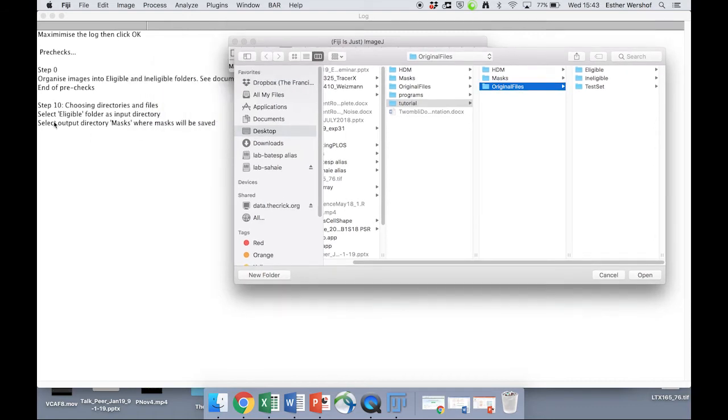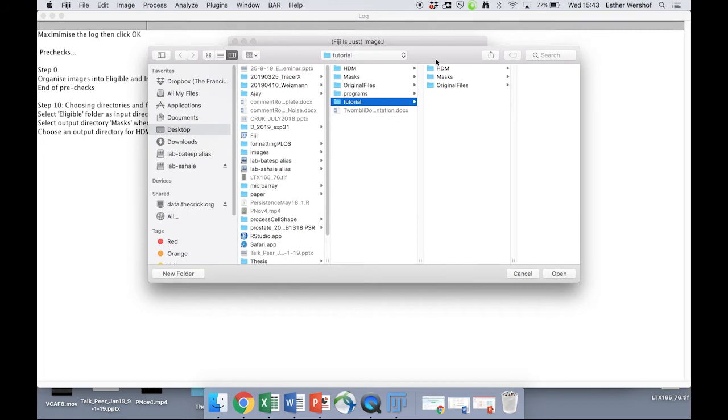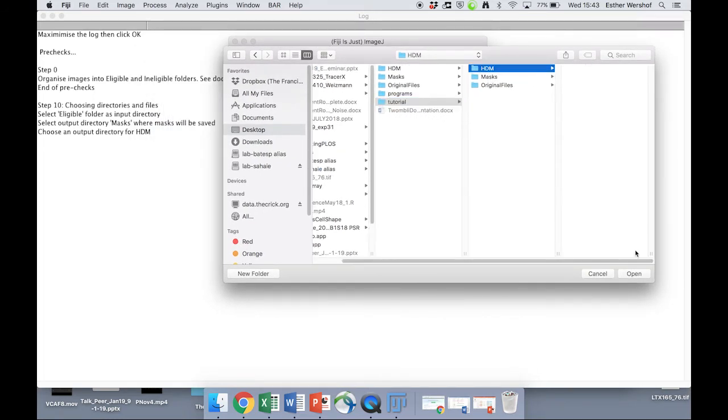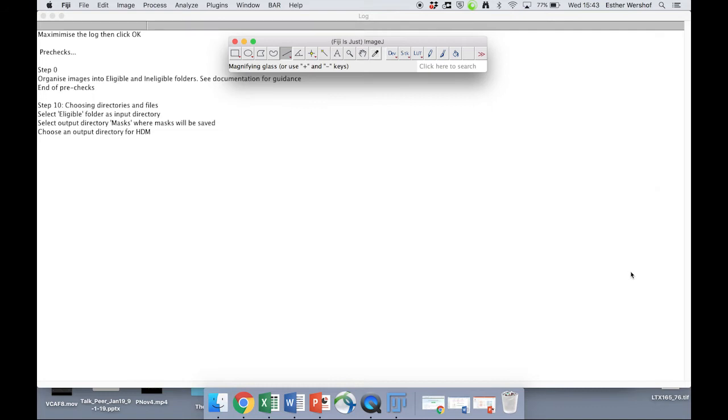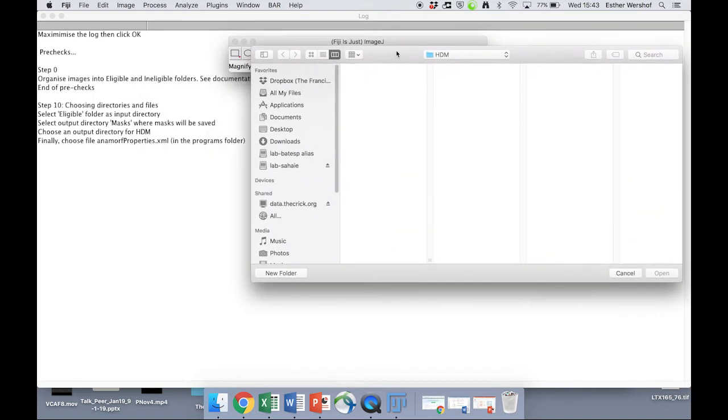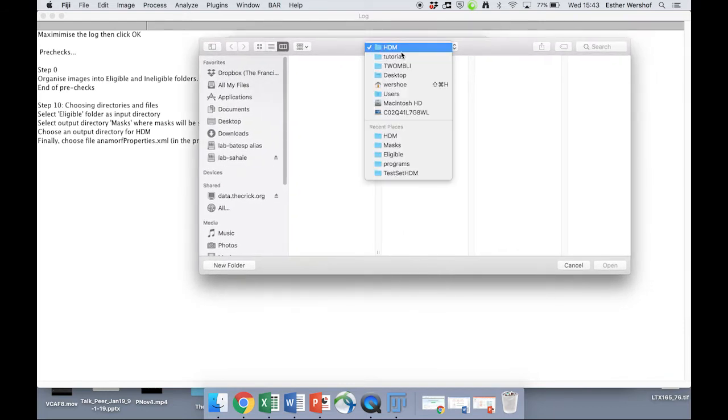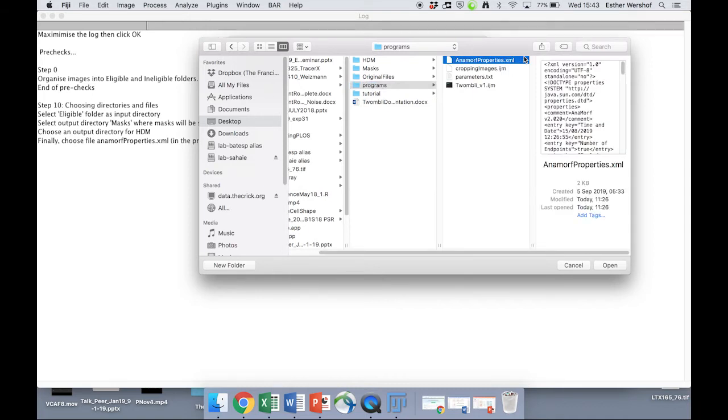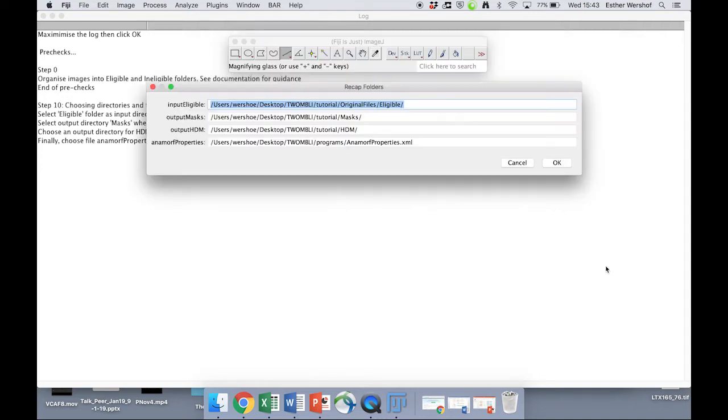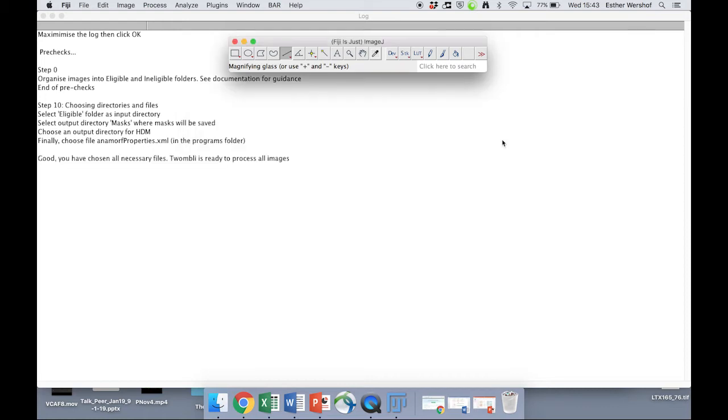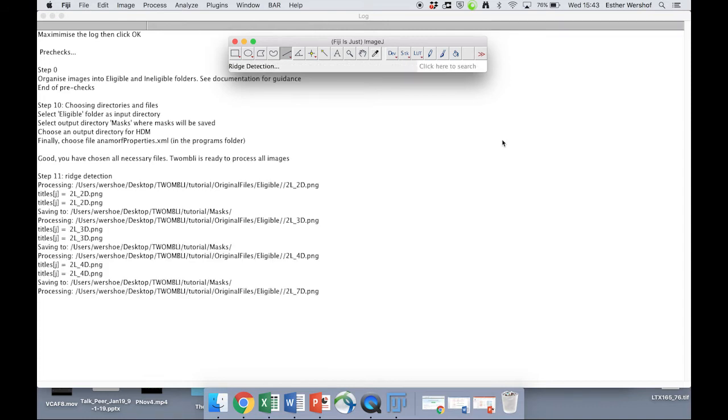We need to select an output directory where the masks will be saved, so we're going to click on tutorial and masks. We're going to be asked to choose an output directory for HDM. And finally, we're going to be asked to choose the AnaMorf properties XML folder. Now that is inside programs, and you don't need to open this or do anything with it, just to select it. You have a final chance to recap those directories and change anything where you might have made a mistake. You're asked if they're all correct, and they are.